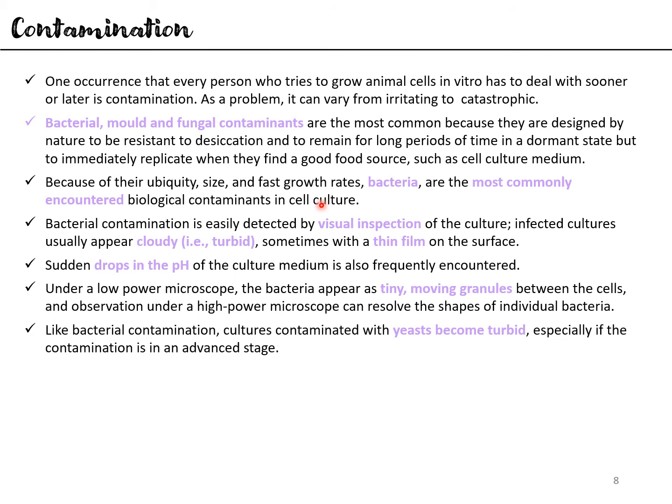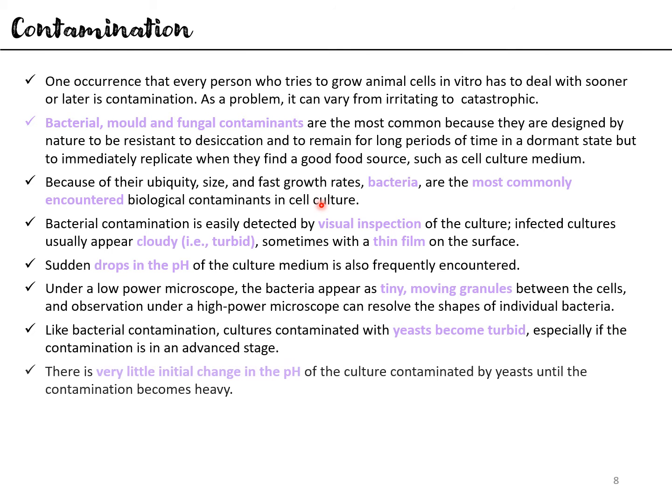It is always advisable to wear lab coats when handling mammalian cell culture or any cell culture, because this will provide an additional protective layer and anything on your clothes can't really fall onto your work surface. And of course, you'll be wearing gloves when working with your cells, and you sanitize or sterilize your hands periodically with 70% ethanol. You sterilize everything that you're going to work with. So precaution is better than prevention. I'm sorry, prevention is better than cure.